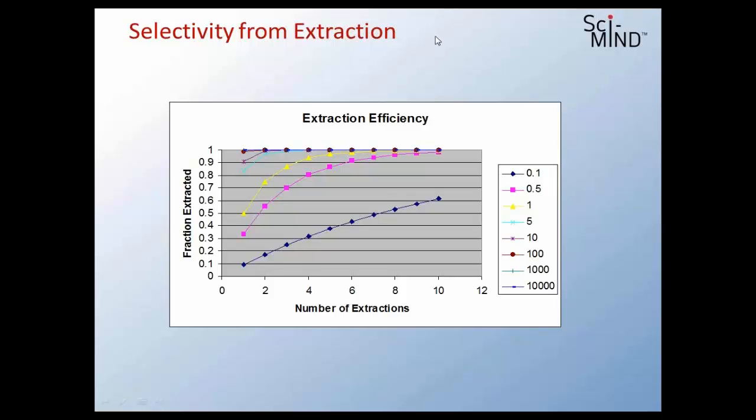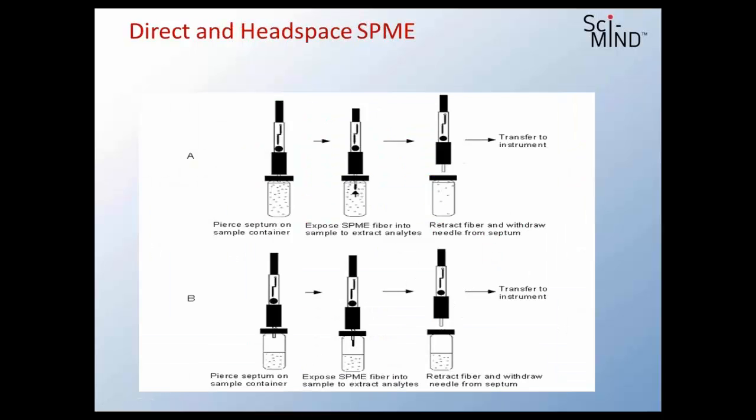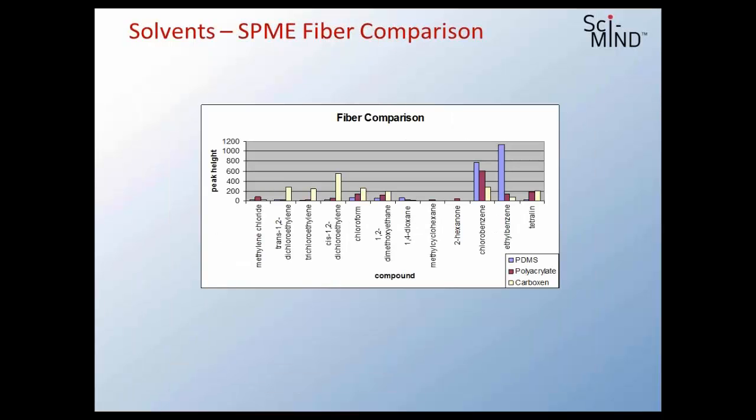That's a great comment. So I'm going to jump through a couple of slides here on extraction very quickly because we're heading into our first question and answer session. Just wanted to make a few comments about a technique that we've used a lot in my lab called solid phase micro extraction, SPME. This is the one with the fibers. We dip those into the sample, and you can do what's effectively a liquid-liquid extraction into the fiber. This is where some selectivity questions show up.